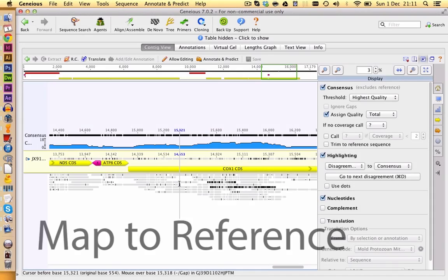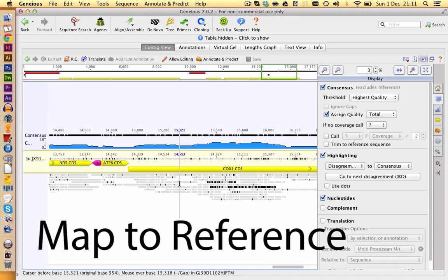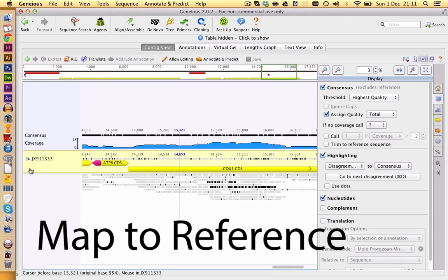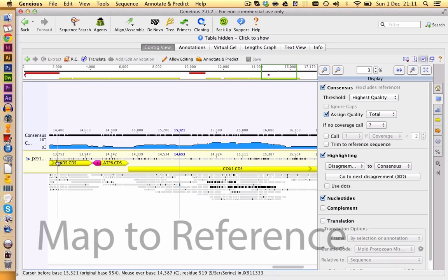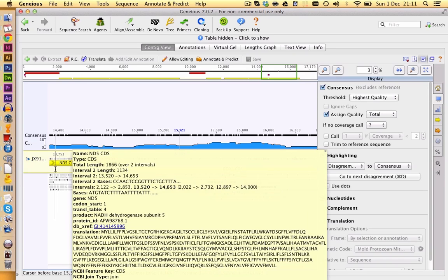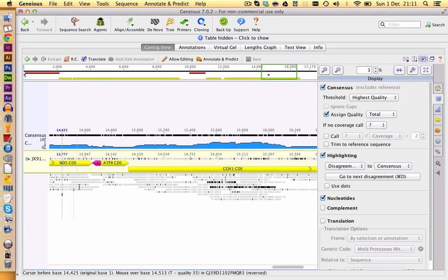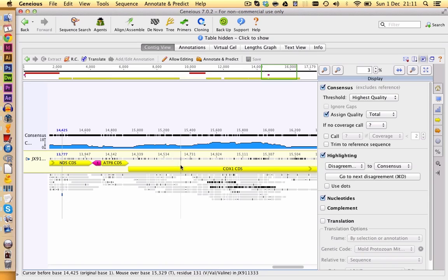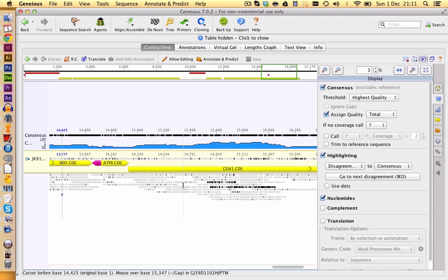Next, we have the term mapping to reference. So in this case here, we have a reference sequence of a coral. And down here, we have mapped all our reads to this reference sequence. The black dots you see here are gaps or mismatches towards those sequences.